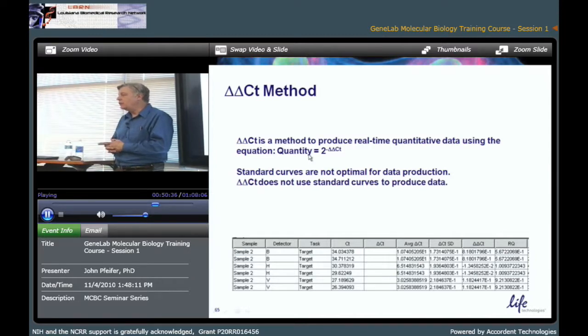And the researcher had, I believe, a cloned version of the adeno target. And so, of course, you pre-quantify that with OD260, do the stoichiometry on that to turn it into molecules. And then he created an absolute calibrator. So he could take a known number of molecules of the adenovirus and mix it into control human DNA. Actually, we sell that. Pretty cheap, but it's good quality. So we know the exact ratio. In fact, I think it's really cool if you can make the ratio 1-to-1.